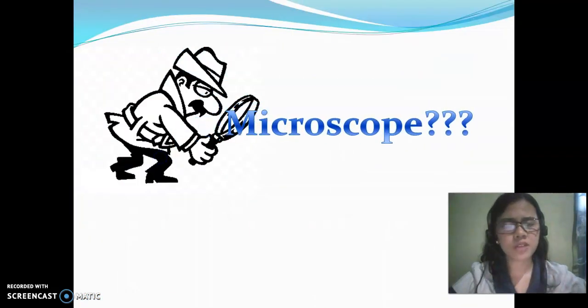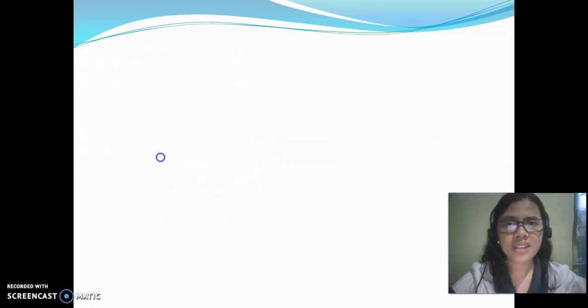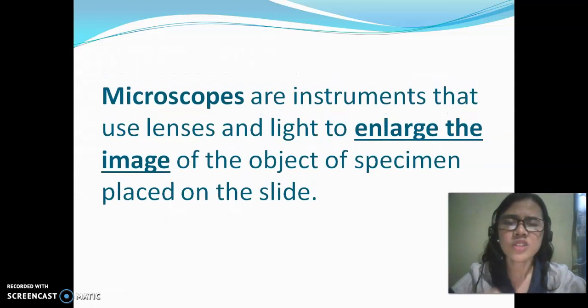What is the microscope? For millennia, the smallest thing humans could see was about as wide as a human hair. When the microscope was invented around the 1590s, humans suddenly saw a new world of living things in the water, in the food, and under their noses.